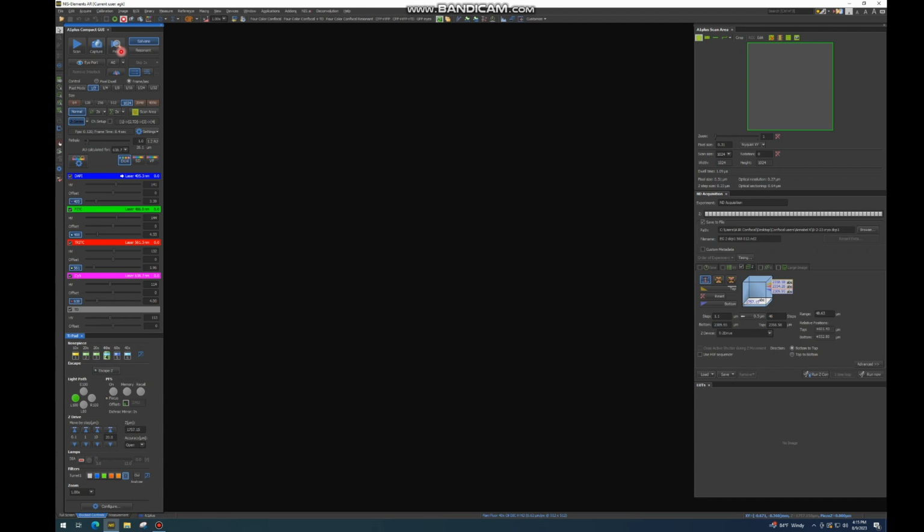When you click Find, that turns on the high speed, low resolution settings if you just want to quickly go through your sample. Fortunately, we find that our system is fast enough to where most people don't use this, but it is available to you if you choose to.